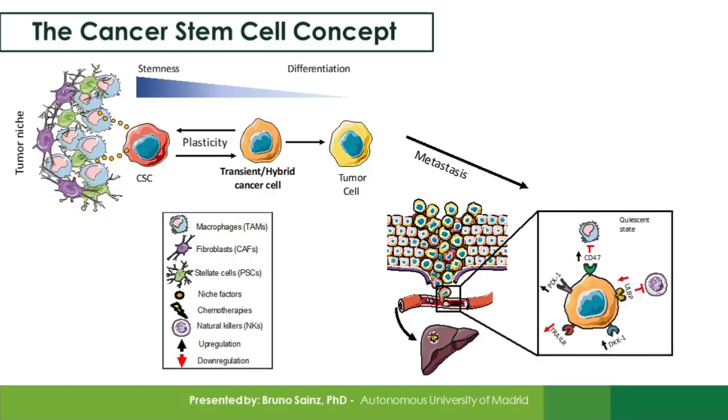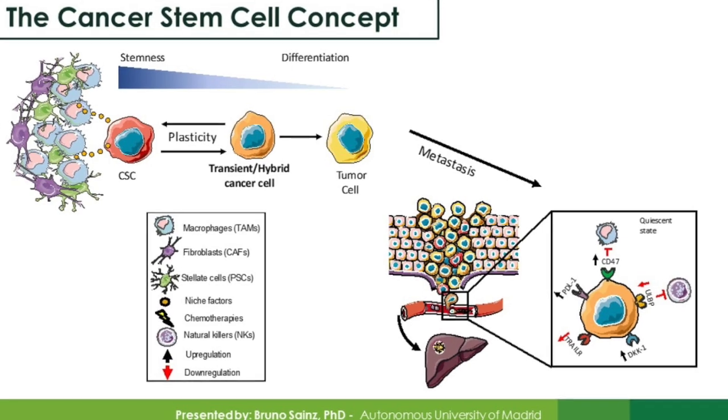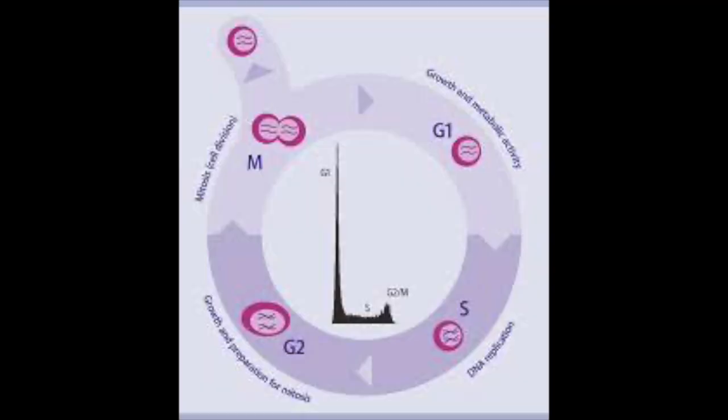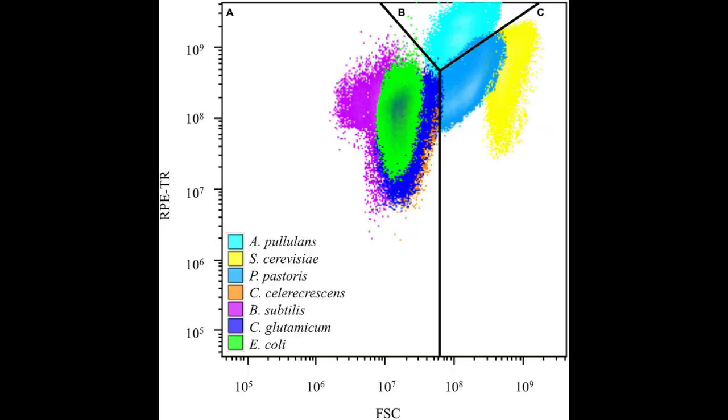Detection of biomarkers, like in cancer diagnosis. There are a whole lot of immunological markers that can be detected using this technique. Cell cycle analysis: which stage of the cycle the cells are in can be detected by this technique. Apoptosis: of course, cell death can be identified from this technique as well. And microbial analysis, for example, bacterial or yeast populations, how their dynamics work can be identified by this method. So what are the uses of this technique in diagnostic applications?